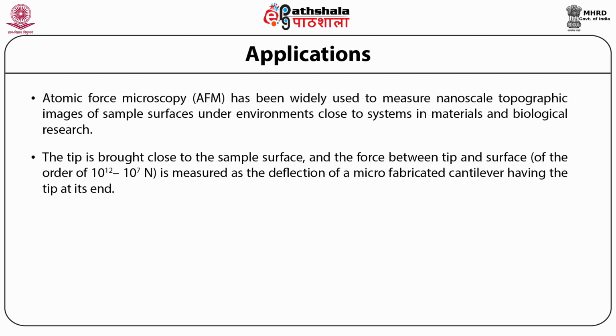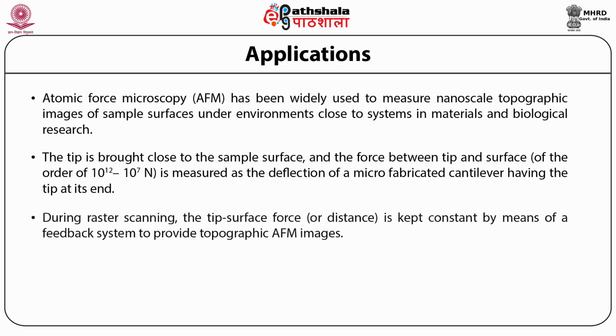The tip is raster scanned over the surface using a piezoelectric device that can control the tip position with sub-nanometer precision. During raster scanning, the tip-surface force is kept constant by means of a feedback system to provide the topographic AFM image.